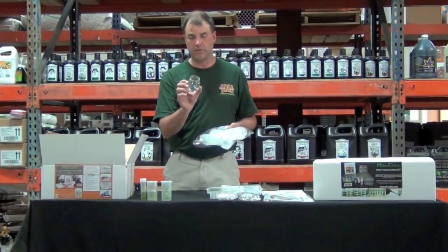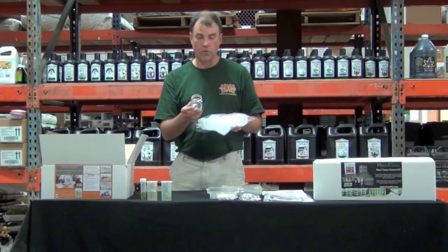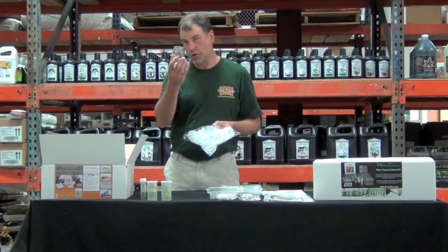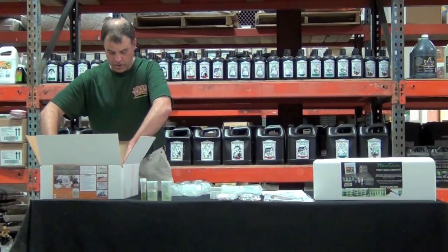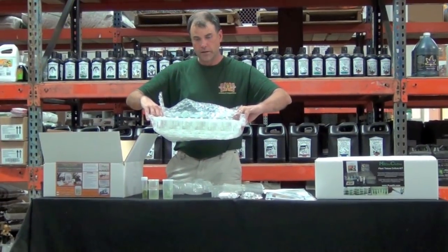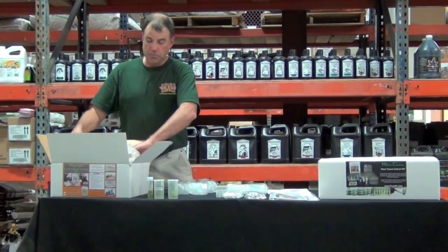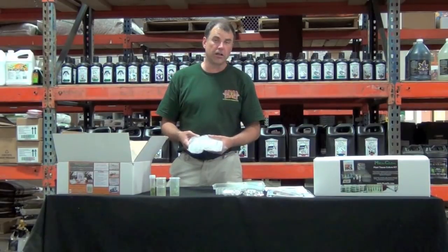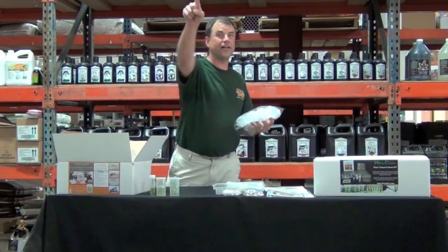It's nice to have a single size that works for everybody. The lids that come in the package ideally fit over the threads — they don't thread on, they just snap on, so you can open and close these with one hand. The kit will come with 30 of these one-ounce jars in a custom 13 by 16 inch molded skeleton tray. Some people will prefer the glass jars because not only are the vessels available wherever you are in the world, but the lids are small, light, and cheap to ship. There are always plenty of new lids available at monstergardens.com.